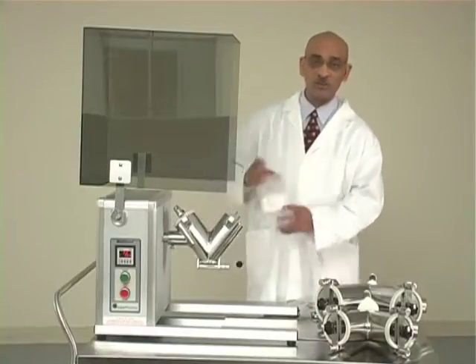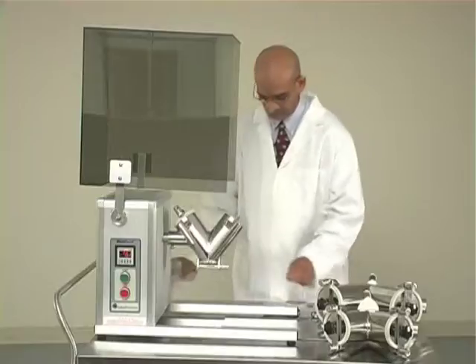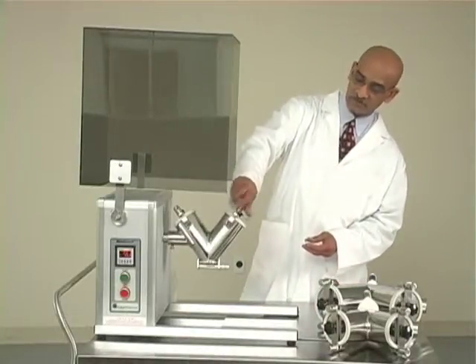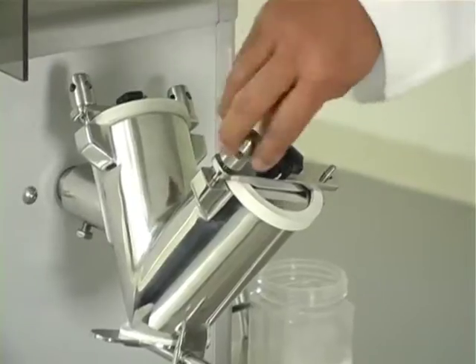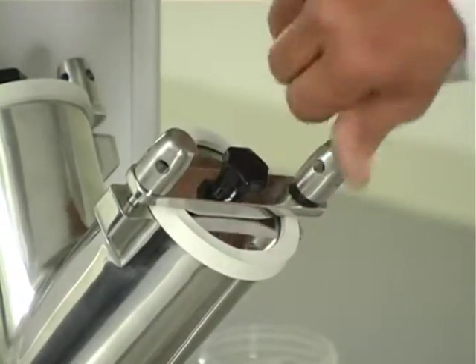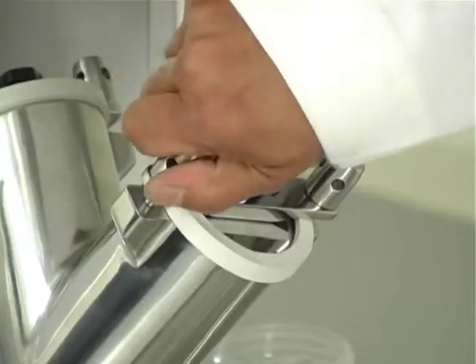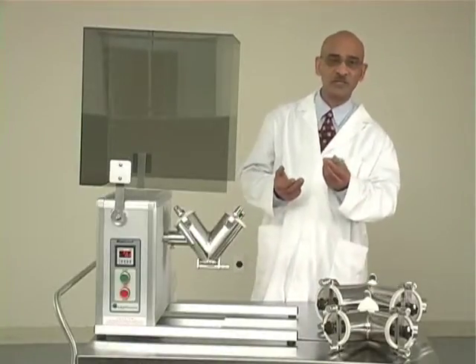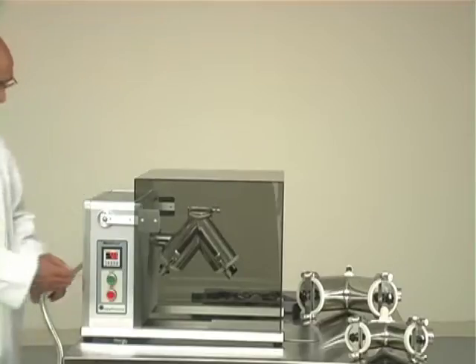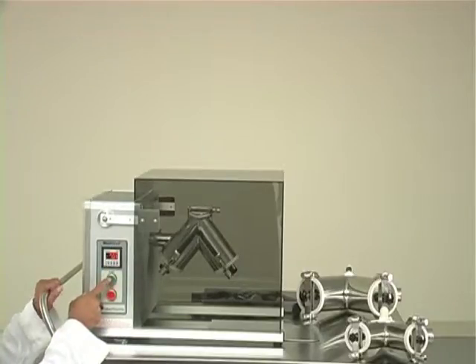Now we can load the powder into the shell. The cover plate will go back on, and you fasten the two thumb nuts back onto the cover plate. Most of the time you may be able to tighten the thumb nuts just with your hands; otherwise, you can use the tool again. We will start the blender just like we did last time — set the timer and then start the blender.